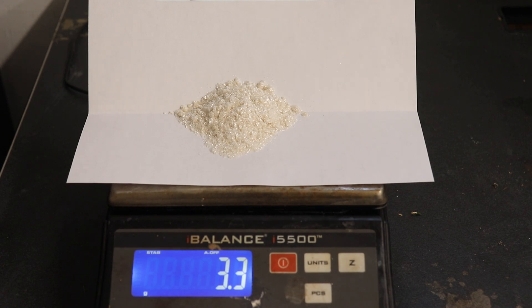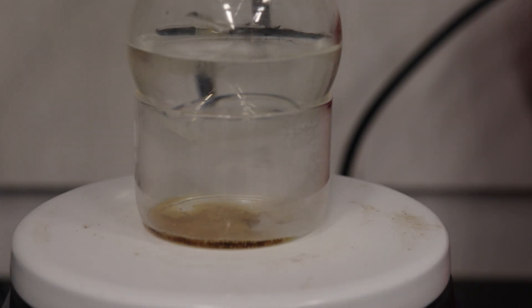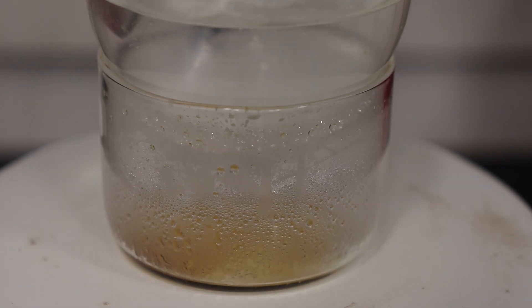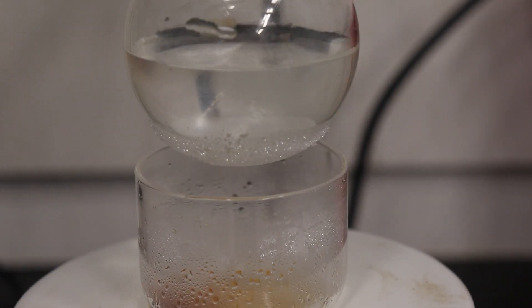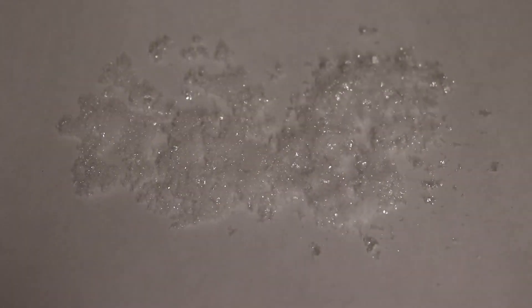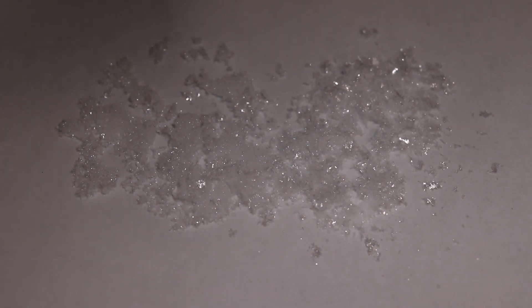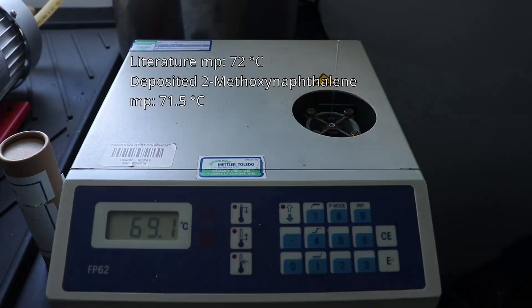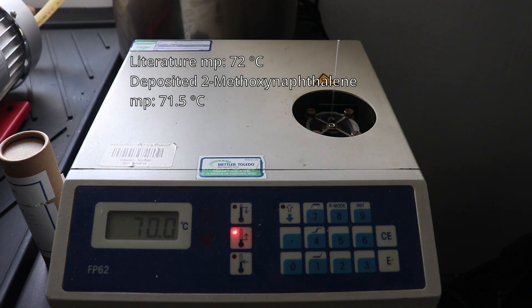I then wanted to try and prepare a highly pure sample of 2-methoxynaphthalene by the evaporation and deposition of the material onto the walls of a cold flask. I did this in an attempt to prepare a reference sample for the melting point value of 2-methoxynaphthalene, to which I could compare my other samples with. The crystalline material I recovered ended up having a melting point of 71.5 degrees Celsius, which is comparable both to the first sample and second sample.